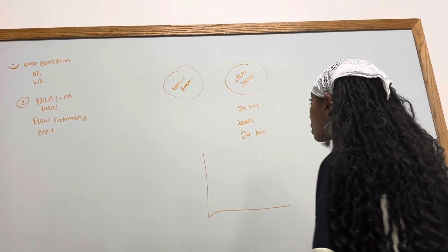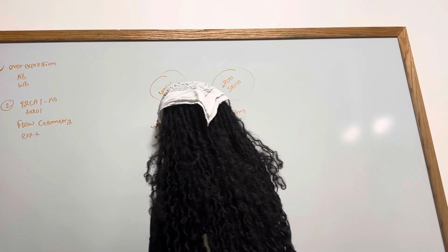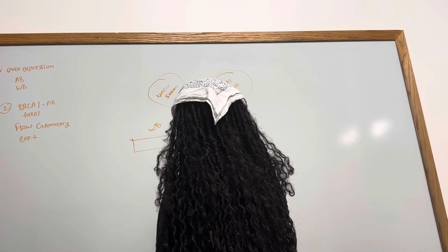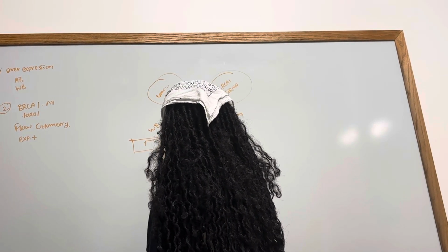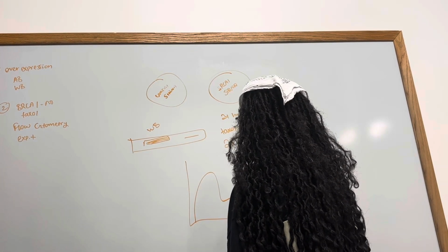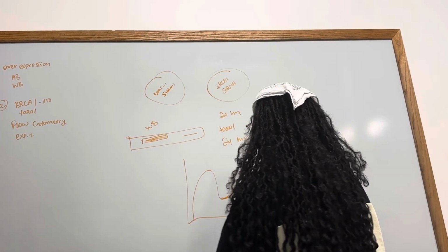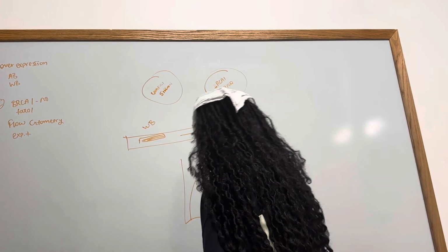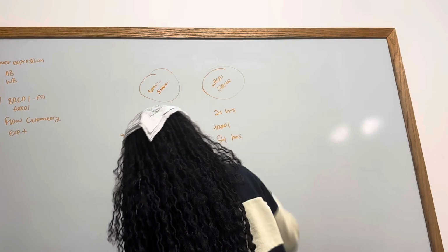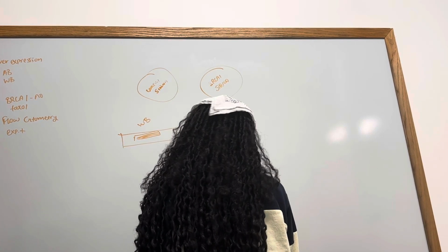Before that, to check the BRCA1 siRNA, we can always do Western blot. And we should expect a small amount of BRCA1 compared to the control. But the flow cytometry should be the same as the normal flow cytometry. Why is that? I'm gonna put number of cells on the axis, amount of DNA.